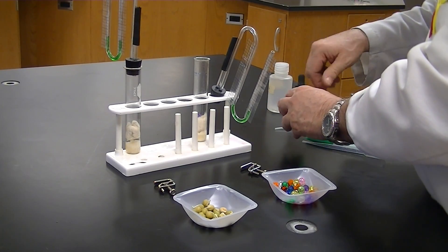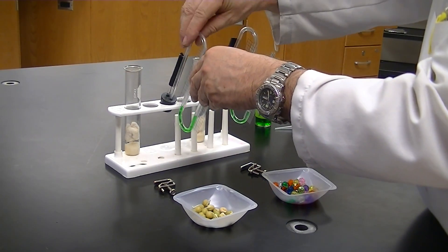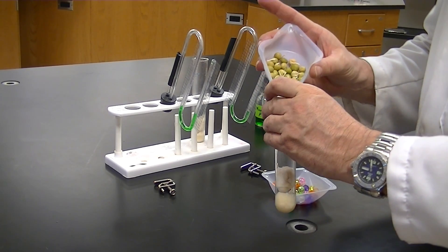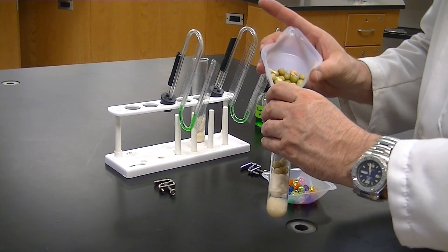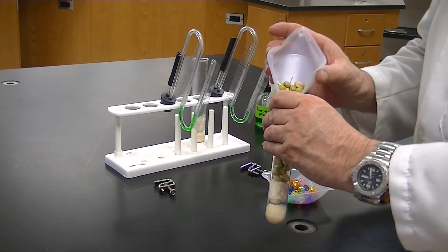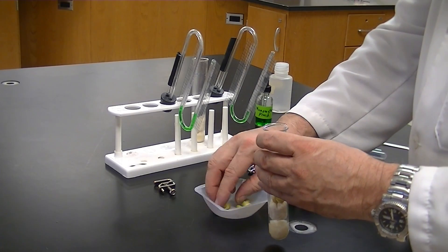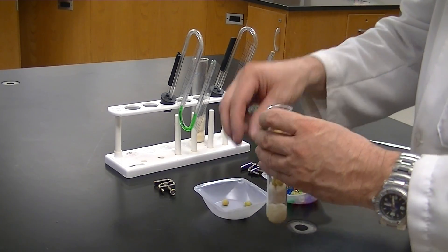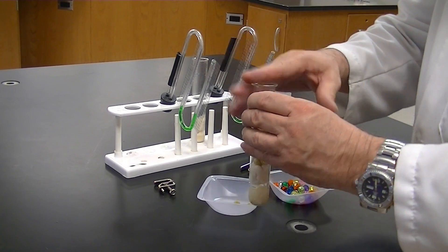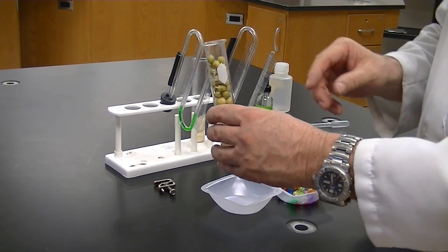Next, add our germinating peas to the test tube. Add enough germinating peas so that the tube is not completely filled — leave about a centimeter or two of air space so the stopper does not come in contact with the germinating peas. Make sure these peas are very well germinated — you should see obvious signs of germination such as roots. The more peas you pack in, the better your results, but definitely leave that air space at the top.